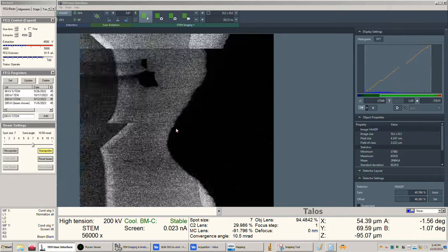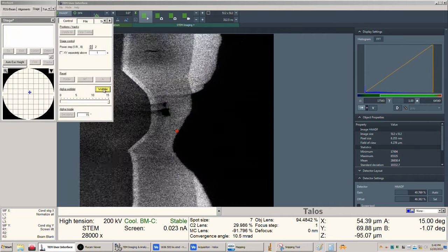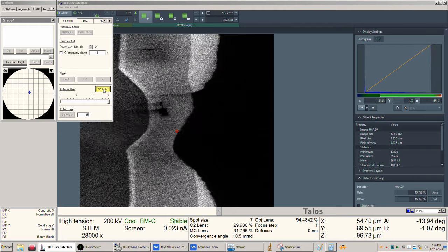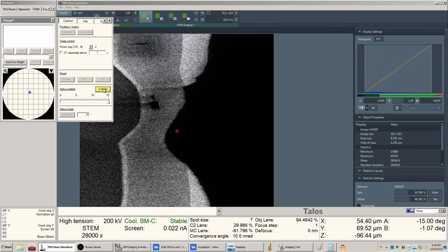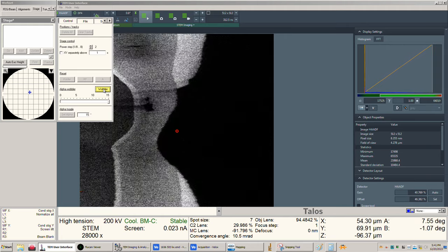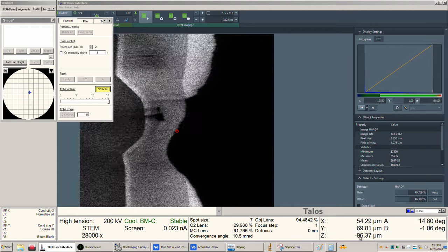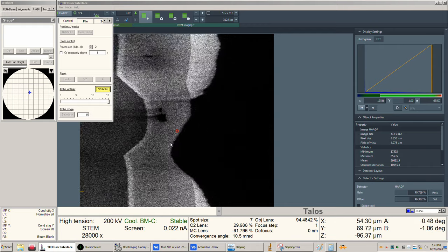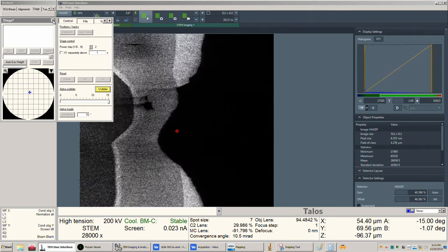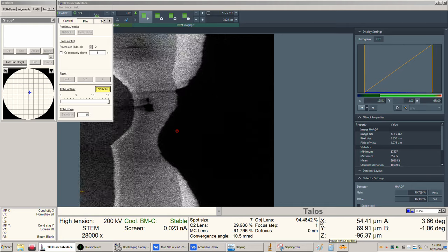Let me do this again, just so I can satisfy my curiosity. Okay, so I was a little bit off here. Okay, so it was a little bit higher than I thought. It was around 1.5 microns, maybe a little bit less than that. Again, that's not terrible, okay? Not unexpected anyways, between nanoprobe versus microprobe. So don't freak out. And again, if it's within a few microns, I wouldn't worry about it anyway.